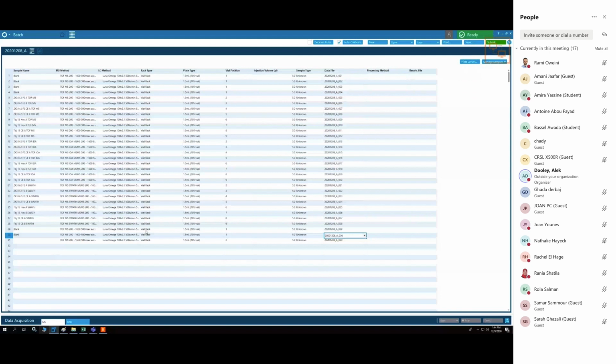So what I will do is I will transfer to you an Excel sheet. And the Excel sheet will have a little bit of help for you in running the batch. Just give me a second to find that. SCIEX. And then we have batch creation. Here we go. Okay, so I'm going to send you a file.